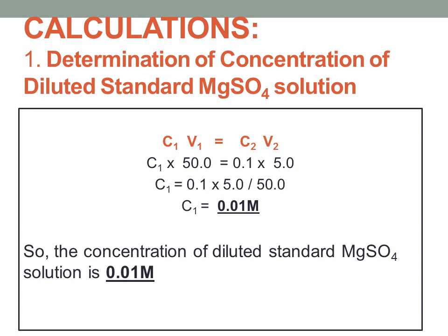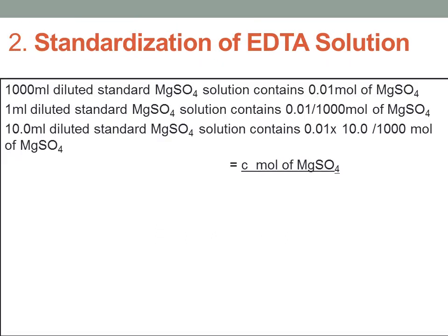What is step number 2 in calculations? Let's find out. Step number 2 of calculations, the standardization of EDTA solution.